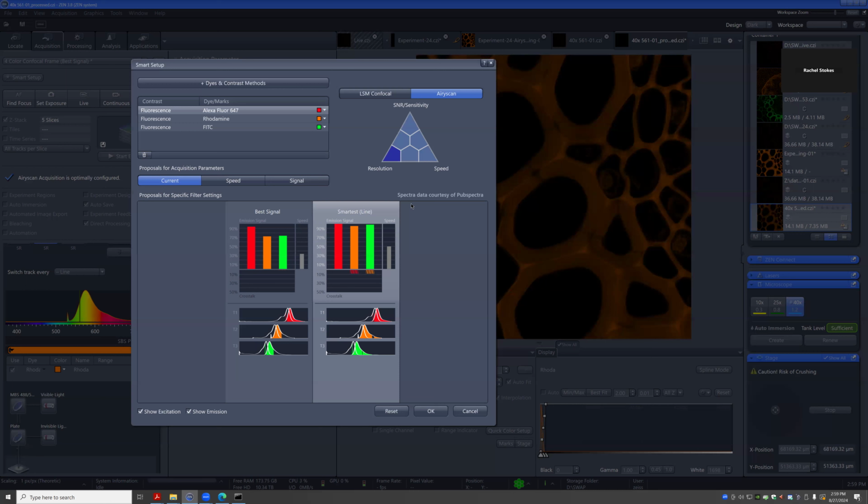Does that make sense? Once it's done, you get the file really quickly, versus having to come in, click the processing, and wait until it's done, especially if it's a large file. It's not hours and hours, but it takes time depending on the size of the file. With direct processing, as you can see here, it came out pretty much instantly, and you don't have to do any extra steps. So it's just faster.